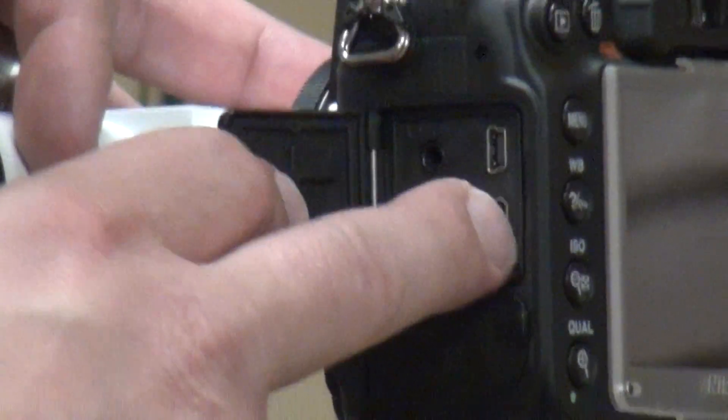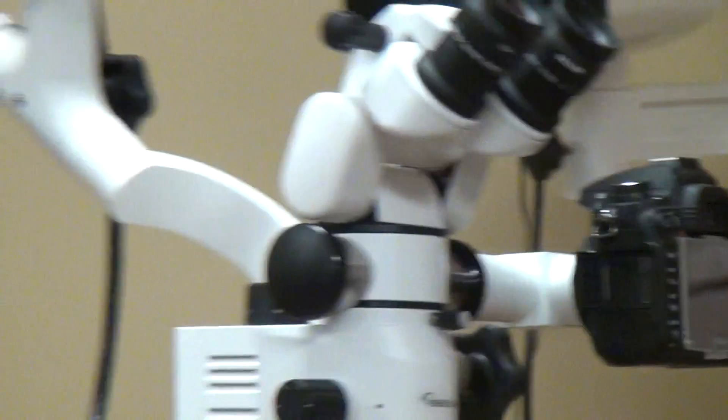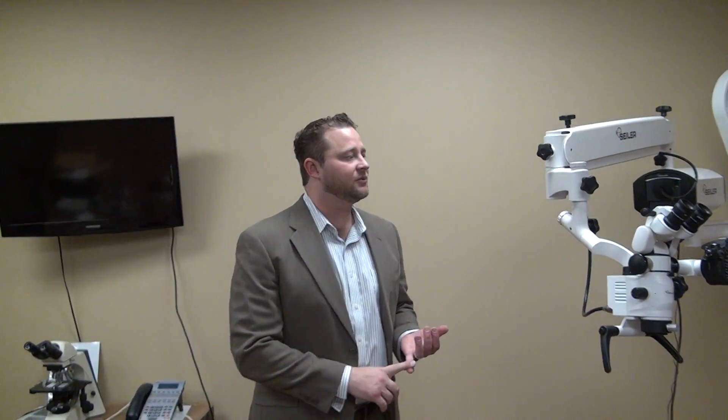So you would plug a small HDMI, run that directly into the monitor, which will give you the full HD. So the camera will kind of give you the best of both worlds — you can take the single-shot images and do the live video.